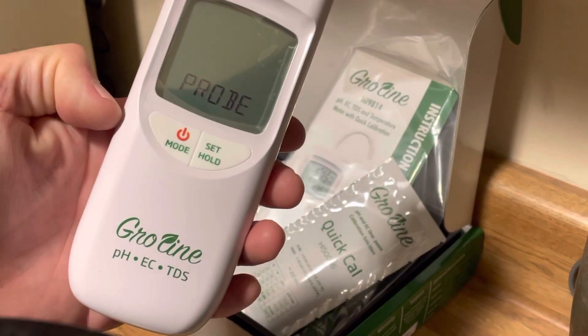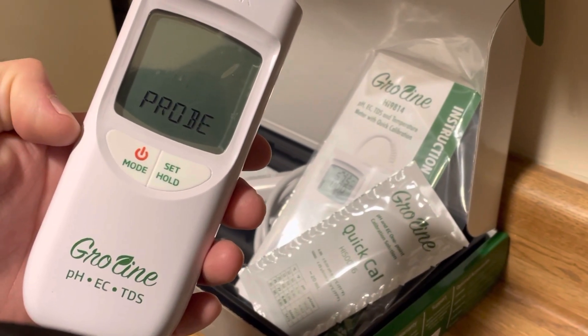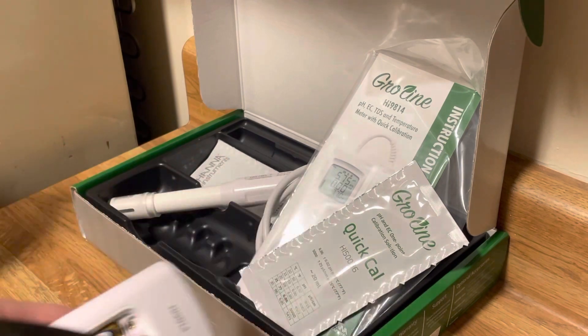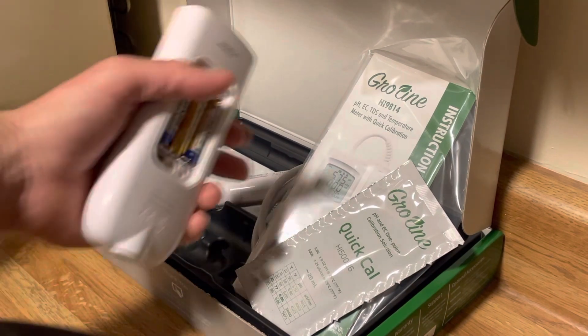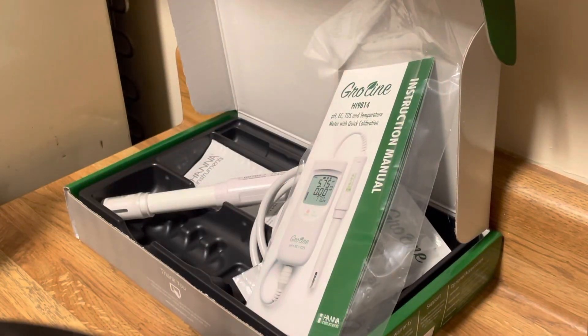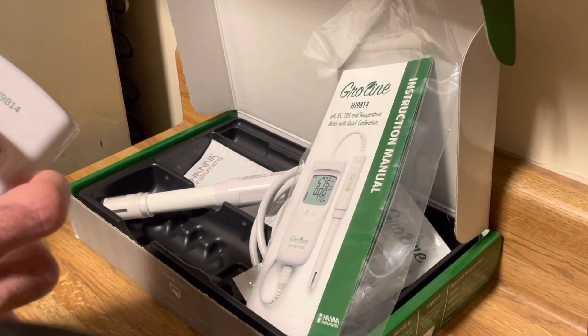We've got the Hanna 9814 here and we're about to put this together. It comes with a probe, some Quick Calibration solution, some cleaning solution, and a booklet. It has a two-year warranty and the probe has a six-month warranty. Made in Romania, and it's going to come with three batteries.